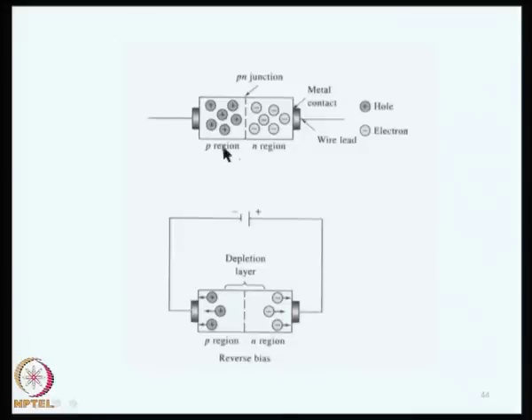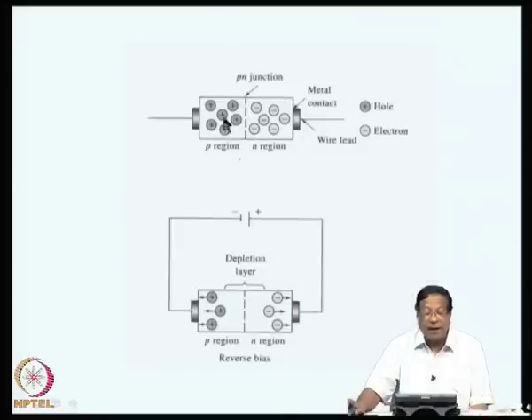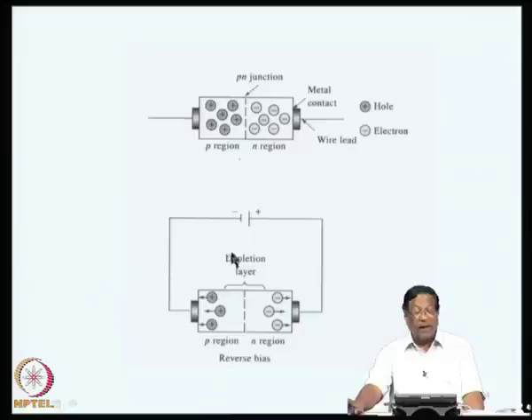Here you can see the normal function of a PN junction. There are positive holes and negative electrons, and there is a metal contact here and a wire lead is taken from this side. These are holes, these are electrons. So, when this is operated under reverse bias, what happens? This region gets depleted, the P region and N region. So, essentially there is no current passing through the contacts.